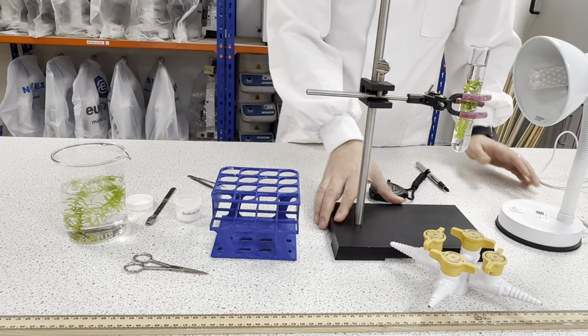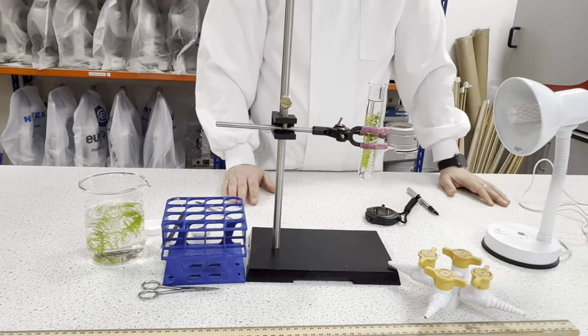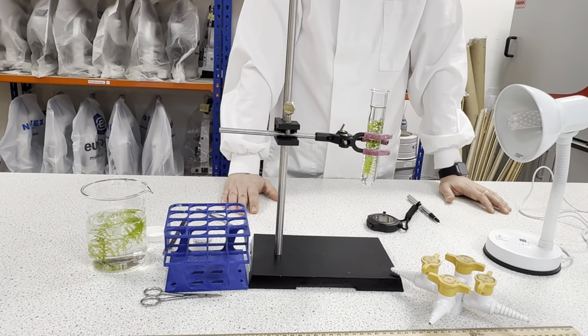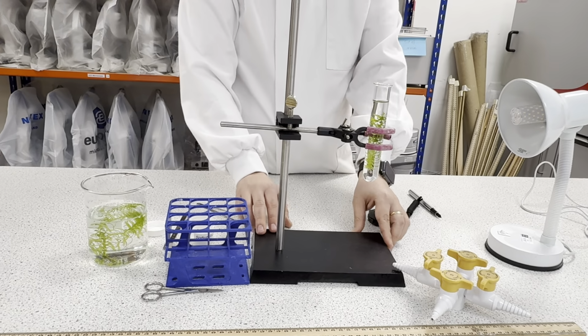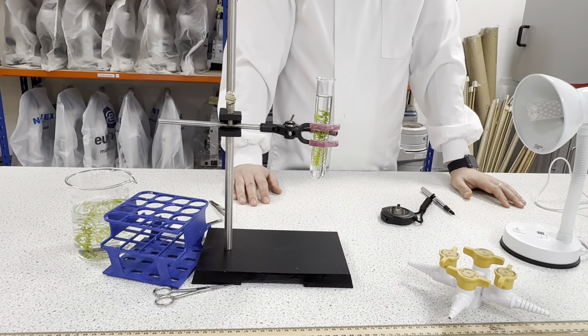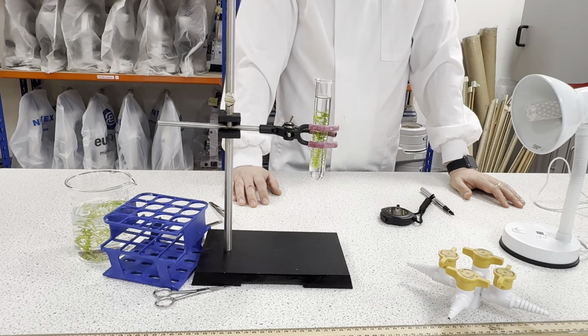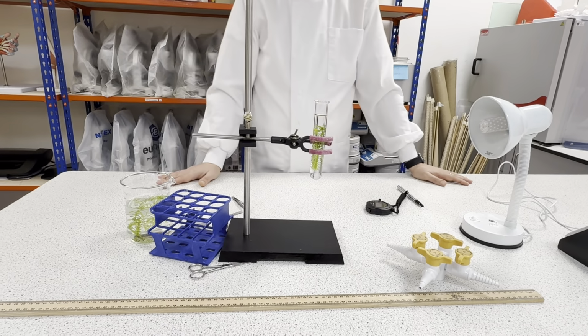So from 10 you go to 20 and repeat the procedure. After measuring, increase the distance from 20 to 30. After measuring, carry on until you reach 1 meter.